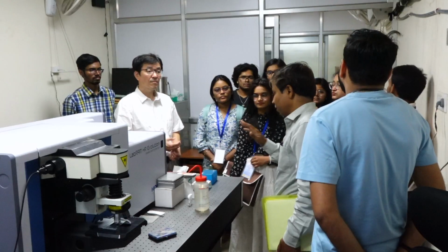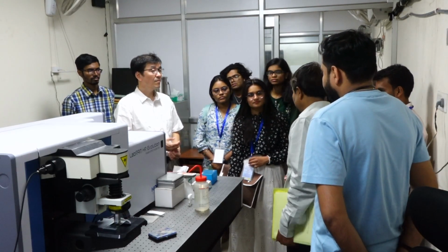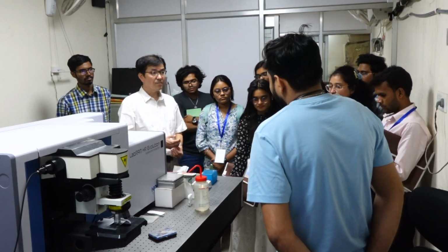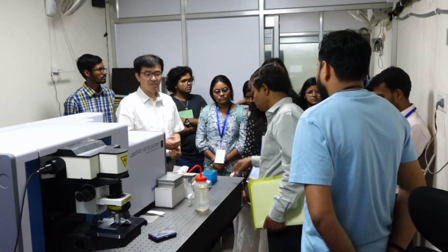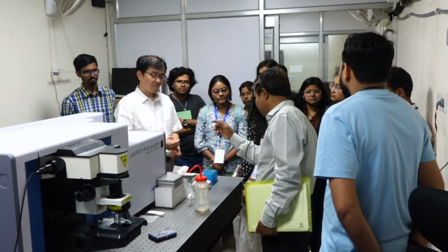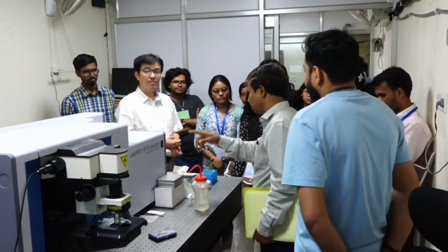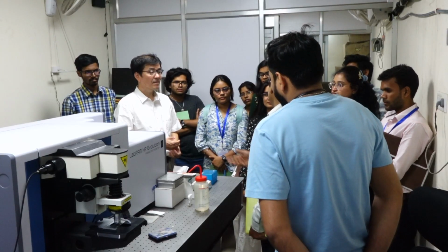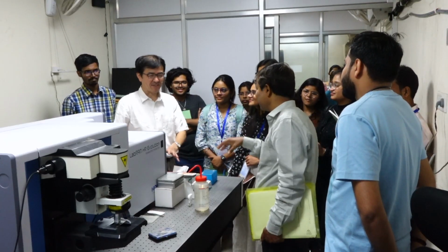Okay, so this is a kind of compact instrument, but professor, they can make this instrument on an optical table. In their laboratory, they have all components separated on the optical table. So they use the excitation wavelength and then they use optics to divert that one. So they know each and every action happening inside the instrument. Okay, so they feel more comfortable than this kind of background. Isn't it? You feel more comfortable with, yes.